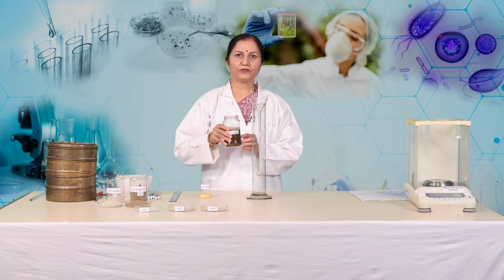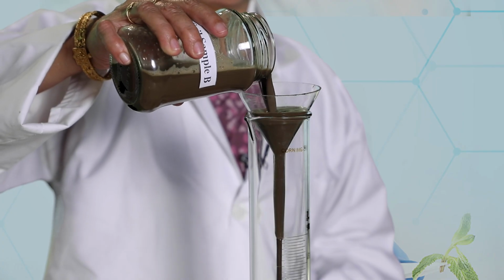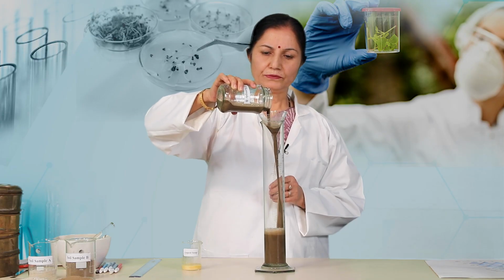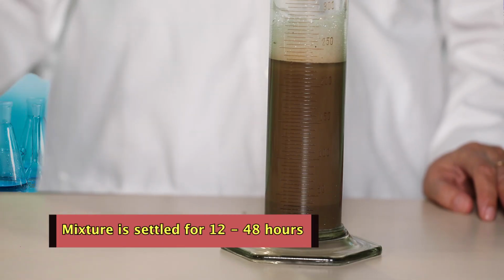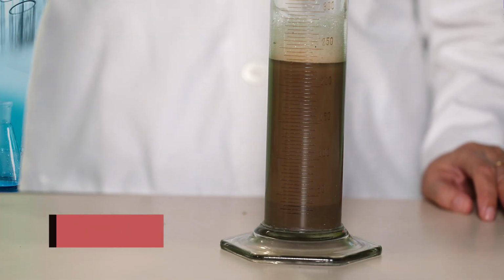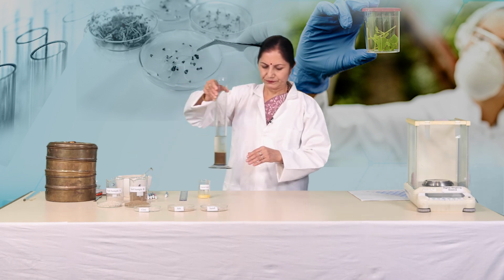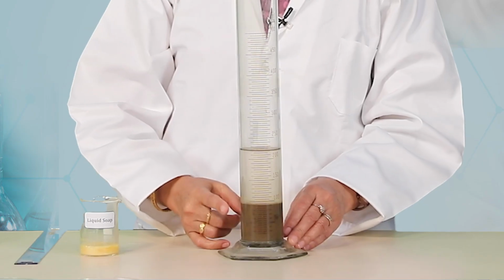We pour this mixture in a measuring cylinder. And let this mixture settle for 24 to 48 hours. After 24 to 48 hours, the layers of soil fraction are visible.